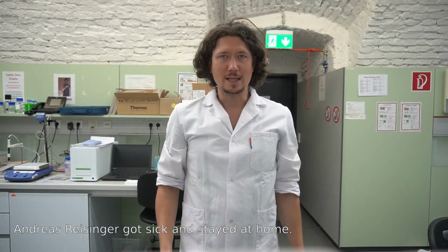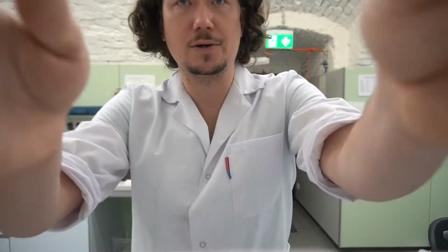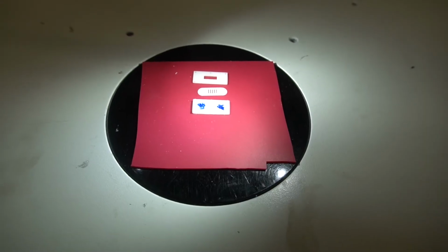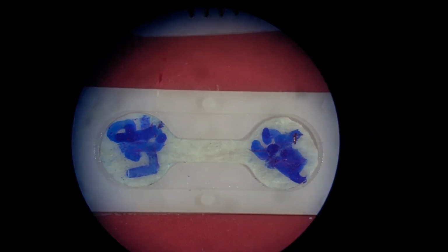I will show you now the last step that we need for our sample preparation before we can do the actual mechanical tests. In this step we will apply a speckle pattern on our small tensile specimens in order to perform optical strain tracking directly on the samples. So we see here our samples placed under the microscope, and here you see our sample aligned.